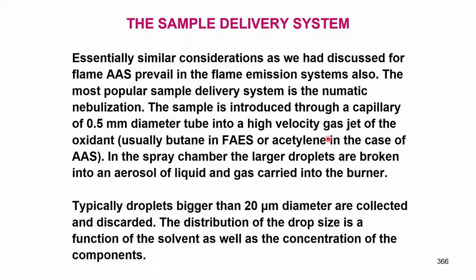So, we will discuss a little bit about this sample delivery system. We have already discussed it earlier; similar considerations in AAS prevail in the flame emission system also. That is why even in atomic absorption we only have to change a switch. The most popular sample delivery system is the pneumatic nebulization, that is, pass the air and allow the pressure to come out through a nozzle which will pick up the sample.